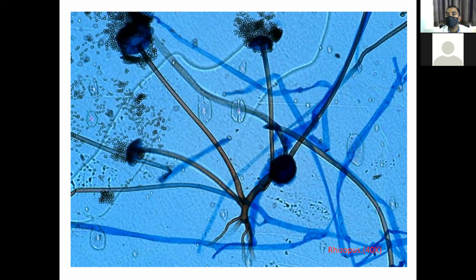If you use the slide culture technique, the whole intact structure morphology is not disturbed, and the relationship between reproductive structures like conidia and conidiophore will be clearly visible. Hyphae, everything, whether septate hyphae or non-septate.